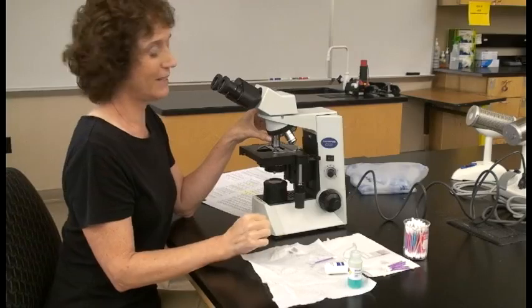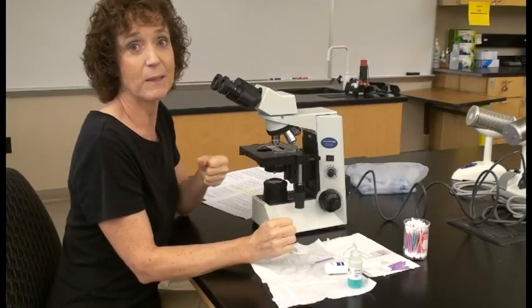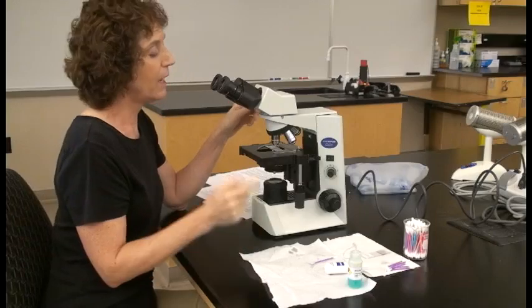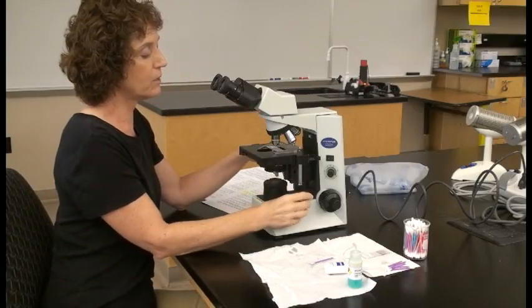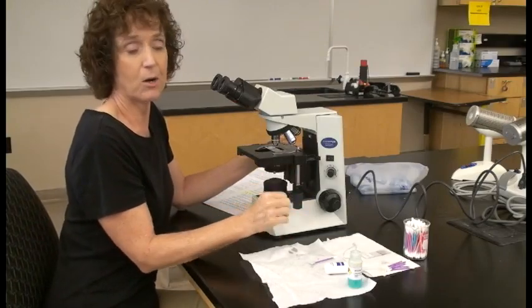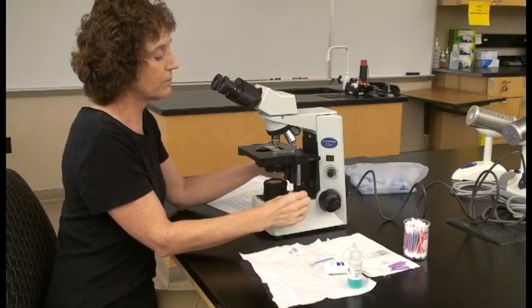Another helpful tip is to use a wax pencil. Make a small mark off to the side of the slide. When trying to focus, move over and focus on that large wax pencil mark since it's easy to focus on, then move your slide over to where your object is.